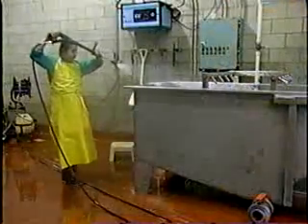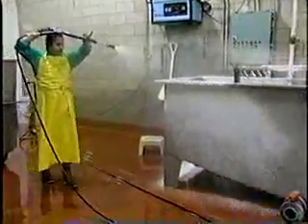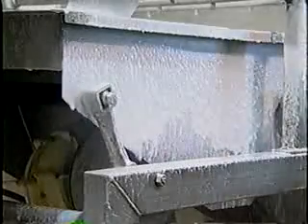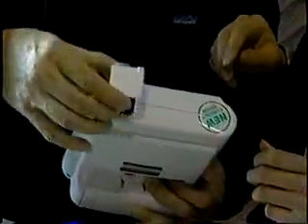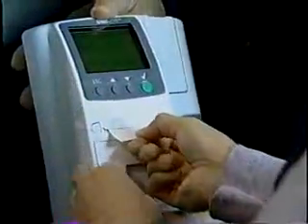Tests may also be done to monitor the hygiene and sanitation of the sprout production environment, particularly the effectiveness of pre-operational sanitation of food contact surfaces and non-food contact surfaces such as floors, walls, and drains. Indicator organisms such as generic E. coli and total Enterobacteriaceae, or possibly the coliform group, may be sought for this purpose. Another type of test may be used to assess the general cleanliness of the facility and equipment surfaces using a technique known as ATP bioluminescence.